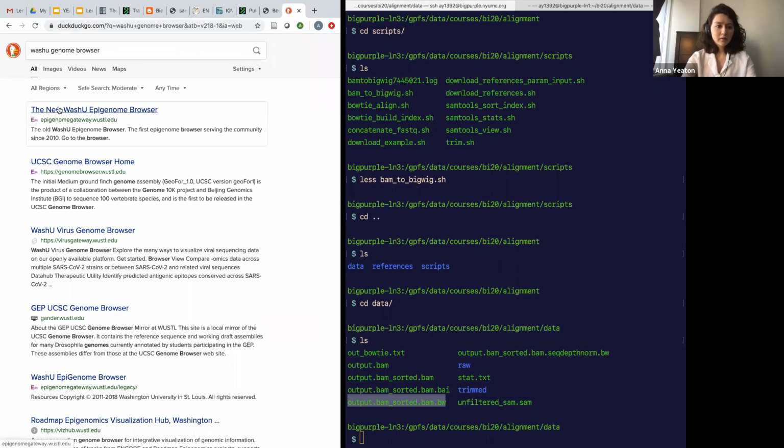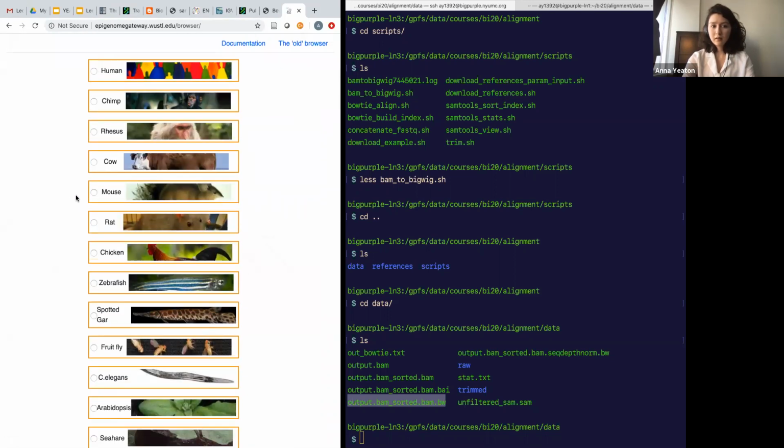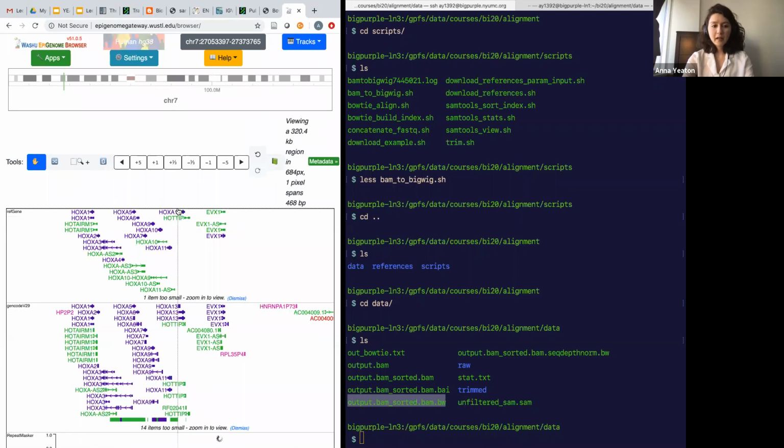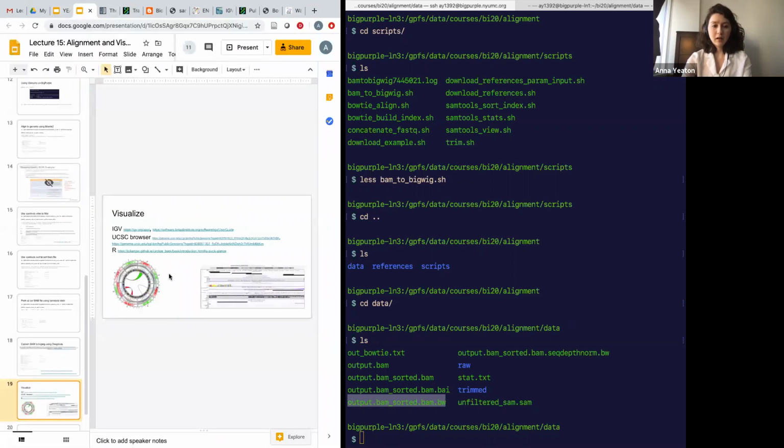Which is good for, there's a new one, maybe things like Hi-C that you can plot here. And then lastly, if you want more control over what you're plotting, like if you want to plot a Circos plot, then you can move to R and use R functions and look into Bioconductor, which has a lot of packages that will help you visualize sequencing data.